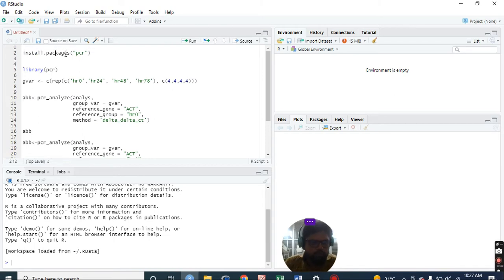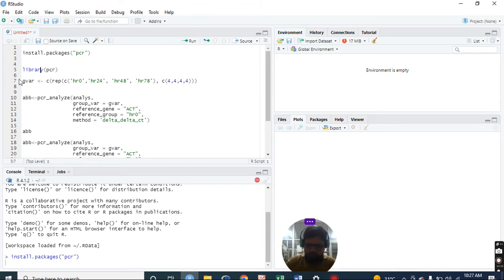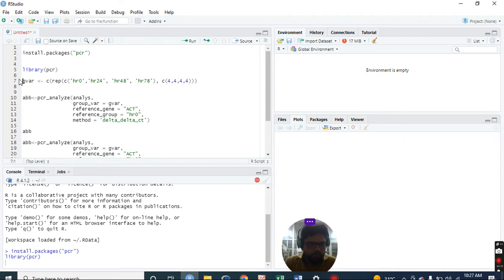First we need to install the package - install the PCR package. I have already installed it on my laptop. We need to call library() just before using any package - library is a function.